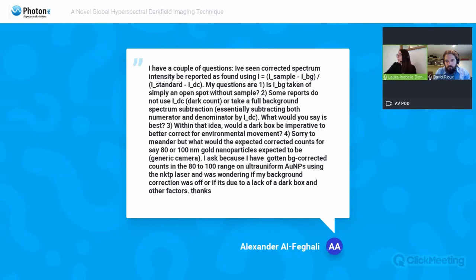We also got questions before we started the webinar, about the spectral range covered by the LIMA, a question that was actually covered by David. As he mentioned, we can cover 400 up to 1,000 nanometers, which is basically CCD or sCMOS range, but we can also cover the infrared, so 900 up to 1620 nanometers, or both. So we can put two cameras and extend the range of our LLTF.